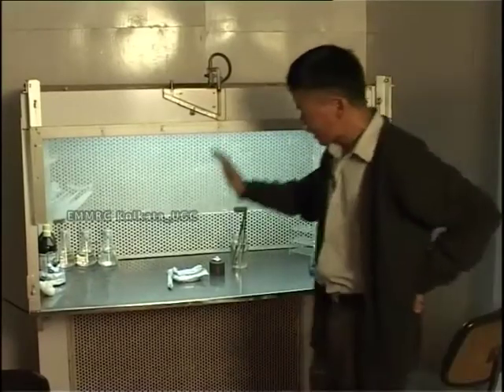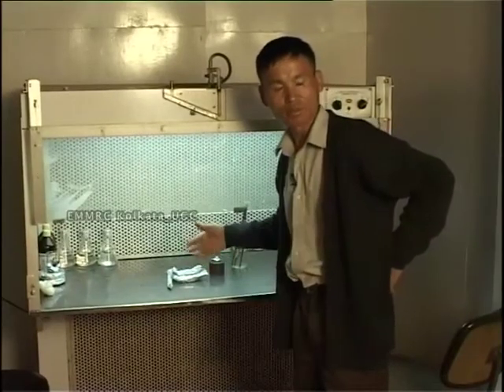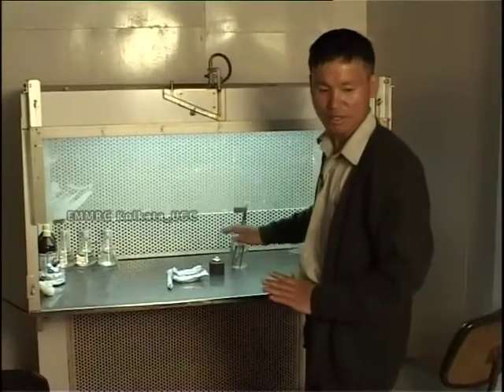Let it run for about 15 to 20 minutes with the blower on and keep it like that. Only after that do you come and sit down and work.